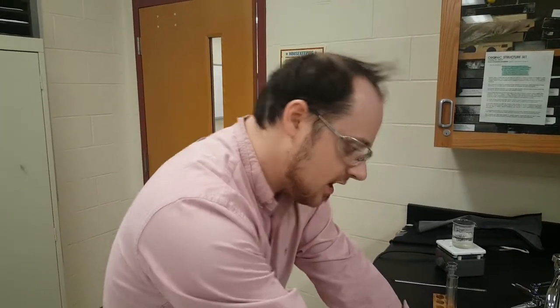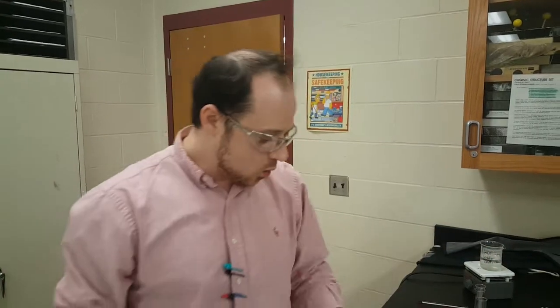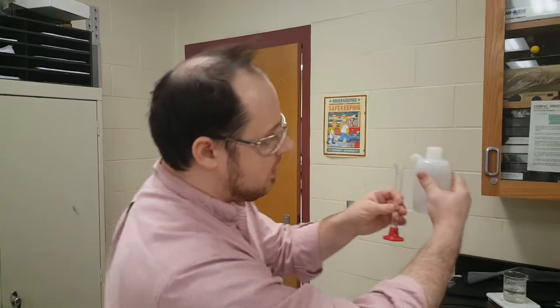Third trial on the first procedure. Rinse it after you rinse. A couple extra drops of water ain't gonna hurt us. We're gonna dilute our acid by 50%. So now it's going to be 10 mils of water, 10 mils of acid. Beautiful. Always start with the water. Measure the water out first.